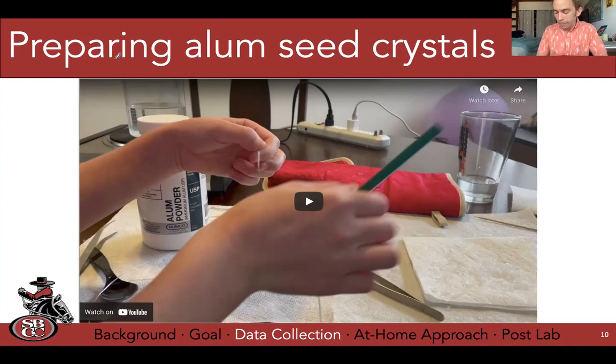Also keep in mind, I can never enforce people to wear lab goggles at home, but sometimes it's interesting. People think only about dangerous toxic chemicals and why they need to wear goggles, acid in their eyes. But glass is a really, really dangerous thing. And I've seen people get cut much more than I've seen serious chemical burns in any lab. And so when you have hot things that you risk dropping, safety goggles is not always a bad idea. And then of course, when we're in face-to-face labs, that will be a requirement for this reason exactly.